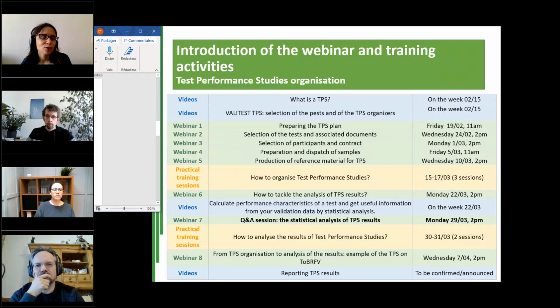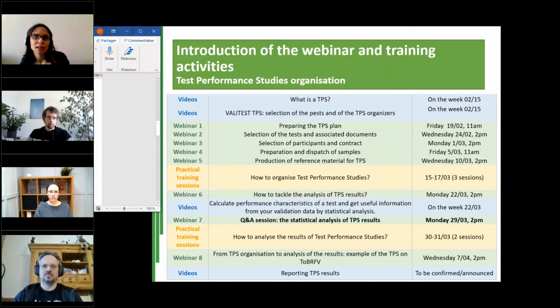For those following our webinars for the first time, VALITEST is an EU-funded project undertaken by a consortium of 16 partners and built to improve the reliability of diagnostic tests performed in plant health laboratories across the European and Mediterranean region. You can find more information on the project on our website. Test performance studies are interlaboratory comparisons that aim at evaluating the performance of diagnostic tests.